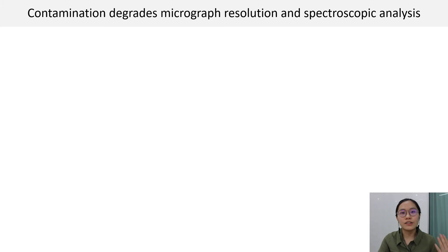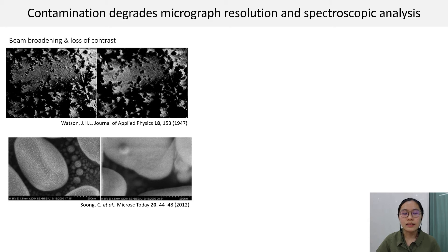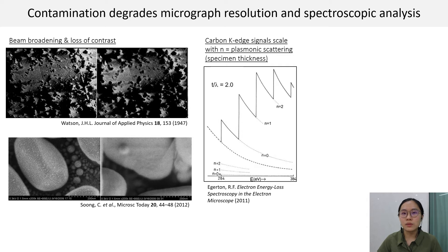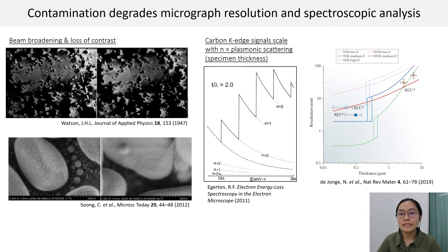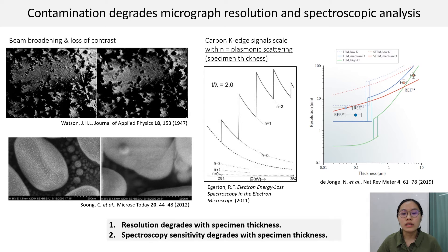The deposition of the hydrocarbon layer increases specimen thickness, and that results in low-quality electron micrographs due to beam broadening and loss of contrast. In spectroscopic analysis such as EELS, the number of plasmonic scattering scales with specimen thickness, and when combined with the scattering of a large carbon K-edge cross-section, it generates a signal so strong that it obscures our other elements of interest. de Jonge et al. provided a nice summary here based on analytical calculation showing that TEM and STEM resolution degrades with specimen thickness. So, increased specimen thickness due to hydrocarbon deposition is detrimental to imaging resolution and also spectroscopy sensitivity.